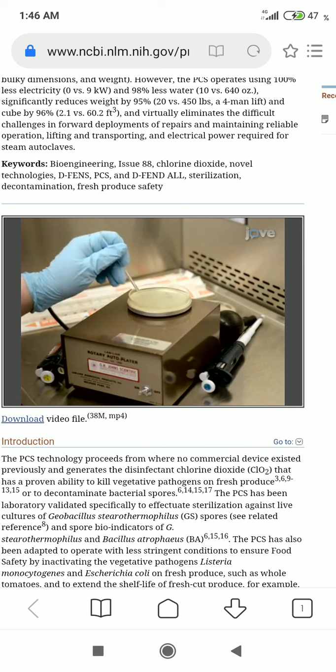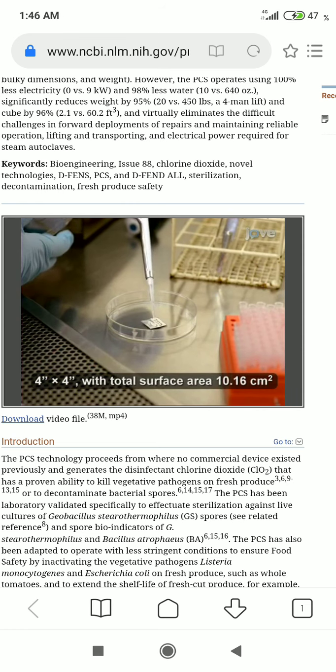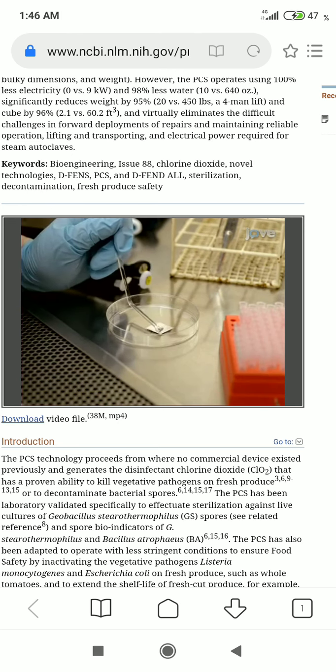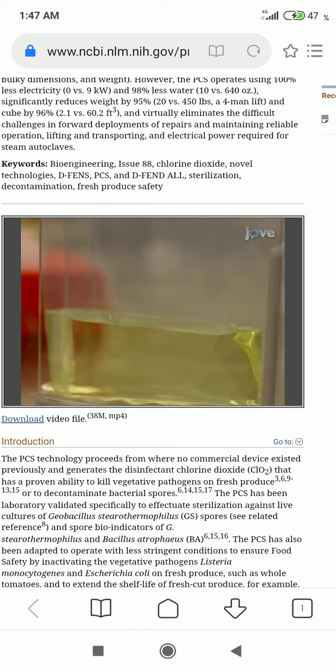For microbiological validation on hard surfaces, inoculate Type 304 sterilized custom stainless steel coupons with 0.2 milliliters volume of Staph aureus, Escherichia coli, or Listeria monocytogenes. Spread the inocula uniformly across the coupon surface, then allow to air dry for 30 minutes at room temperature in a laminar flow hood. Immerse inoculated coupons into solution for contact times of 5, 2, 1, and 0.5 minutes, then quench with sodium sulfite solution prior to enumerating survivors.